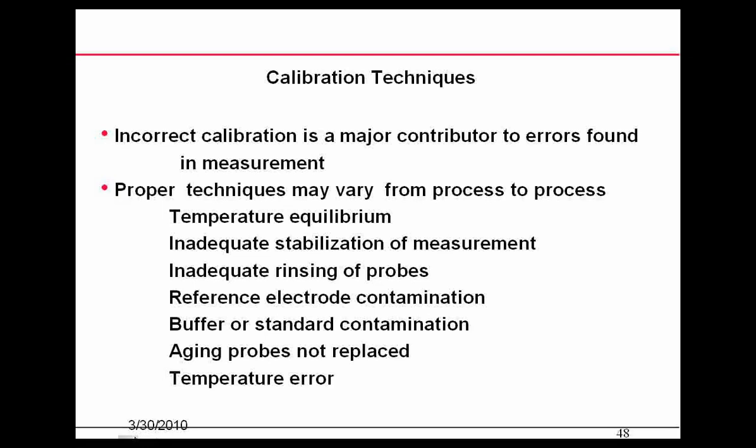If you've got reference junction contamination, or if your buffers are contaminated — perhaps you've let them sit out for a long time — they could be compromised. Temperature equilibrium and aging probes not being replaced are also issues. Probes can get old enough that they become very difficult to calibrate.